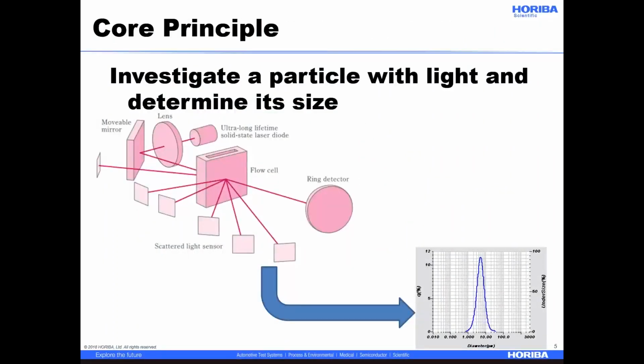The core principle in laser diffraction is we investigate a particle with light to determine its size. And more exactly, we're going to look at the scattering as a function of angle to determine particle size.